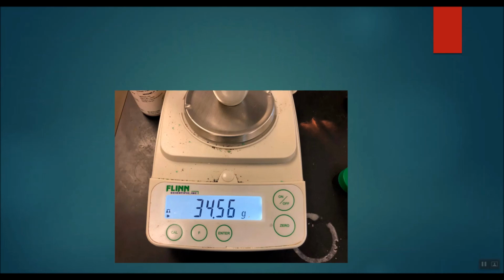But if I have no change in mass, as you can see here, then that tells me that now, I got it all. I got all of the copper in the first try. If I had experienced an increase in mass, then what I would have had to do again is heat it up and mass it again. So you want to be patient with this. If you're too quick, you will end up having to work twice as hard, or you get bad results.